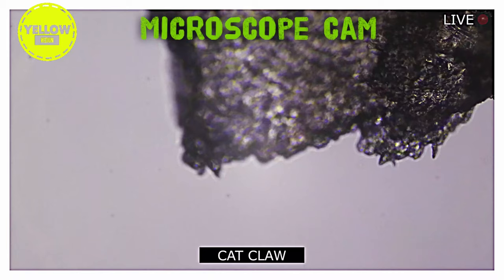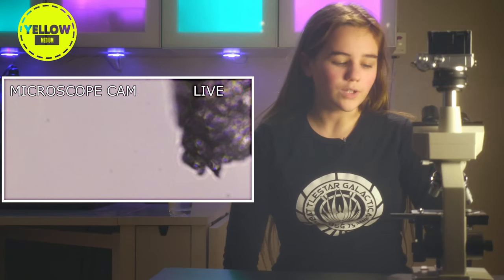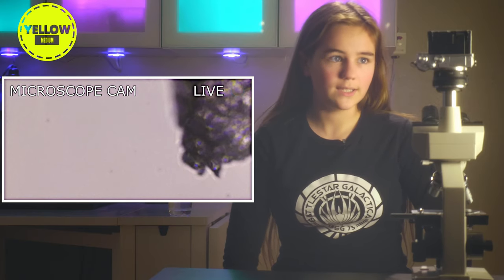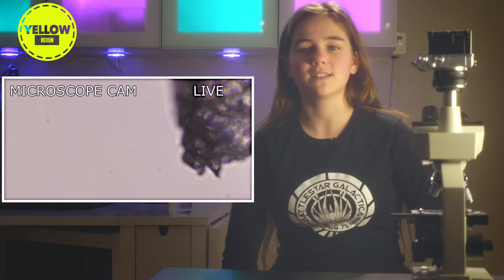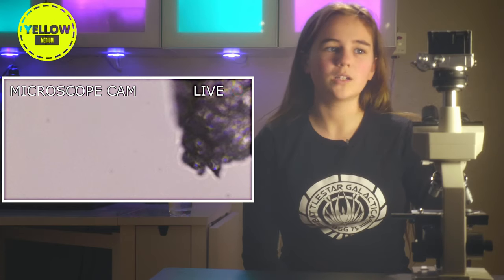I did expect it to look sharp, and it does kind of look sharp, I guess. I didn't expect it to look so hairy. I didn't expect it to look like a drawing, and I also didn't expect it to look like water in a way, but here we are.